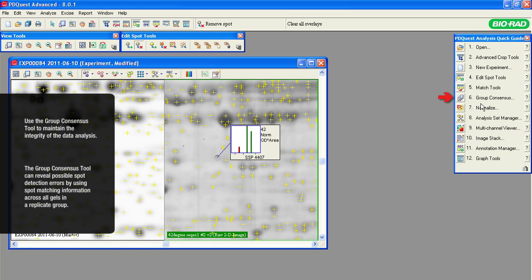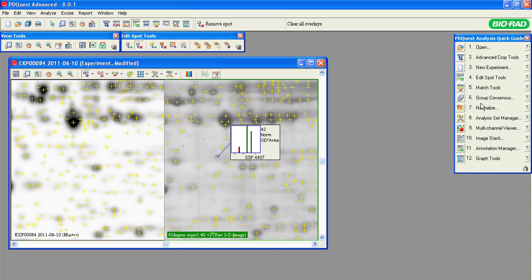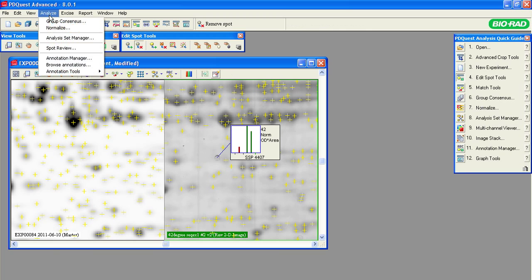The purpose of the Group Consensus tool is to reveal possible spot detection errors by using spot matching information across all the gels within a replicate group. Overall, gel images within the same replicate group should be very similar, and gels in different replicate groups will be less similar. The Group Consensus tool allows the software to address the experimental anomalies and correct your experiment data accordingly.